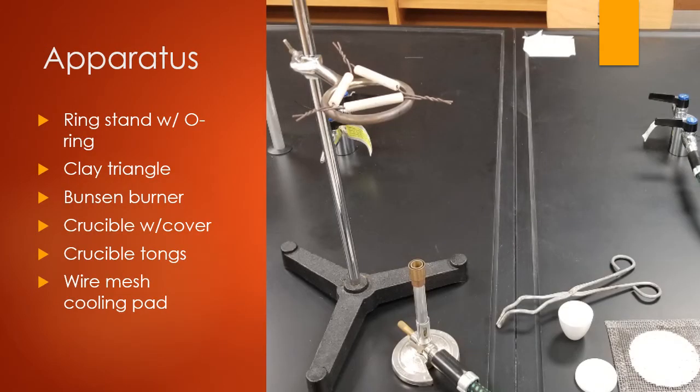So we're going to do this same thing, but with an unknown hydrate. First, what we need for our apparatus is a ring stand with an O-ring, which you can see in the picture to the right. On top of that O-ring we have a clay triangle. This is going to be used to set our crucible in. You'll notice there's a crucible down here in the corner, and there's also the cover, which is kind of blurry, but there'll be a better picture of it in a second.